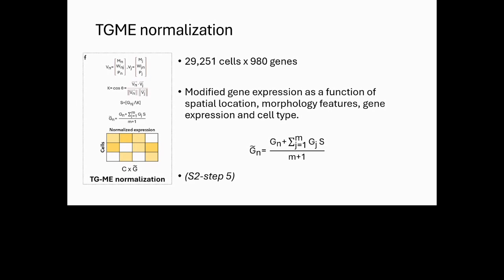We can look at it as a single cell data set in order to infer the microenvironments in this data set. Here we are using just a small region. You're going to see the results in a few slides. But in the complete data set, it's much easier to see the tumor regions, those regions infiltrated with immune cells, those that some people call hot tumors or cold tumors, and to look at the border. That is what we're going to see in the next slides.